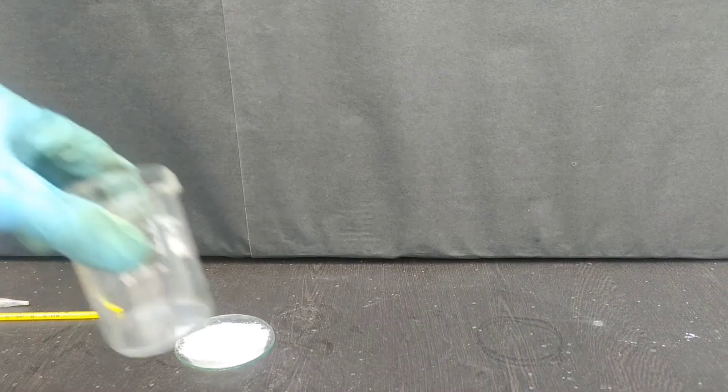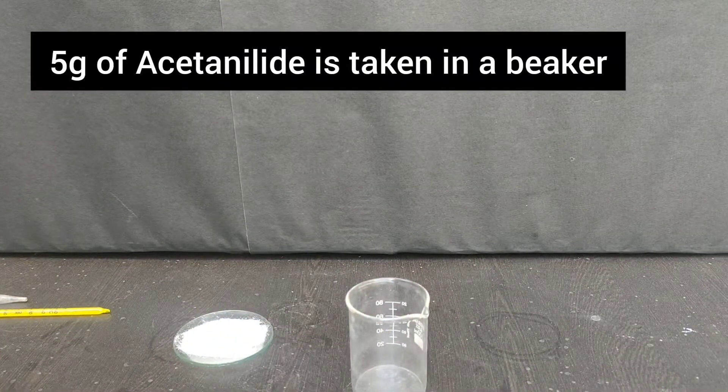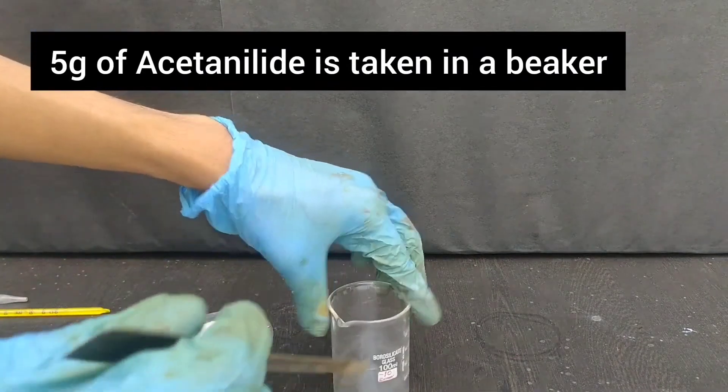First of all, we start by taking 5 grams of acetanilide into a small 100 ml beaker.